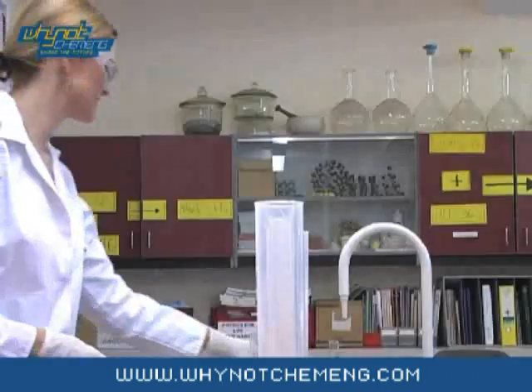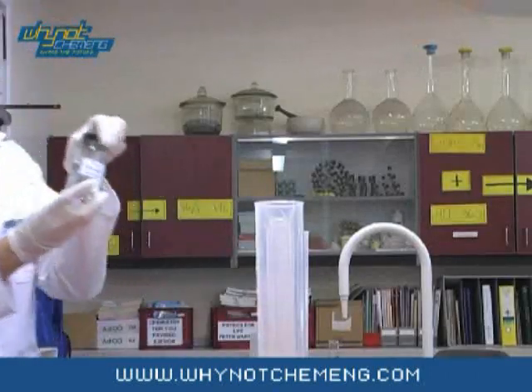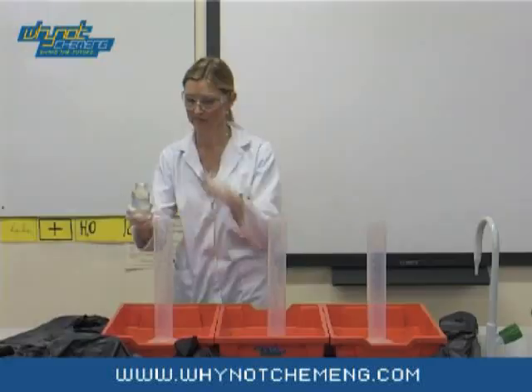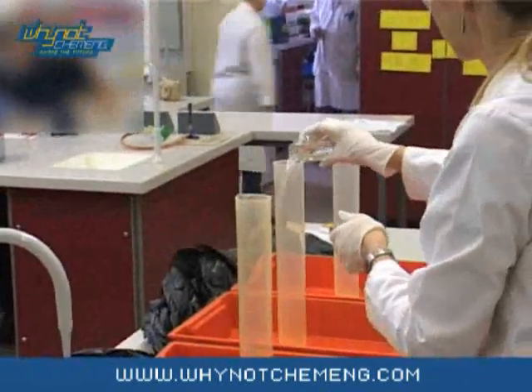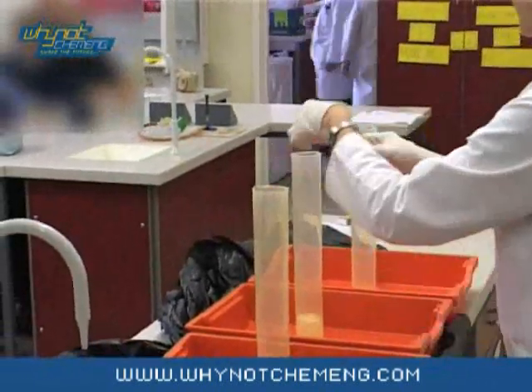This is a very messy demonstration so you will need to cover the surfaces with black bin bags and set up each cylinder in a separate tray. First, add 75ml of hydrogen peroxide 100V to each cylinder. This needs to be fresh as hydrogen peroxide has a shelf life of one year.